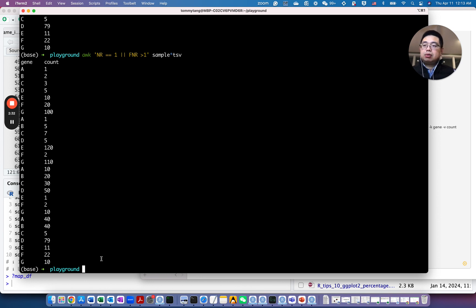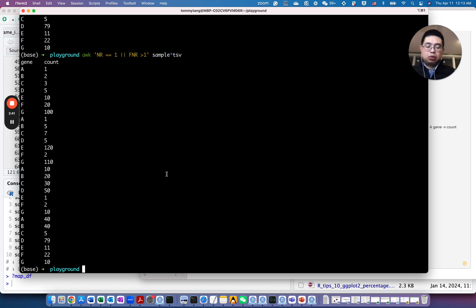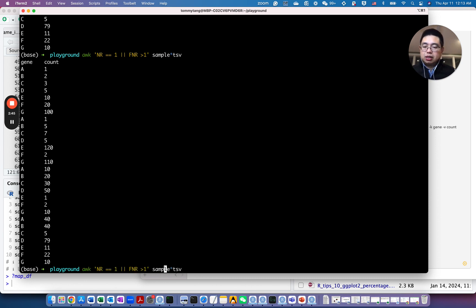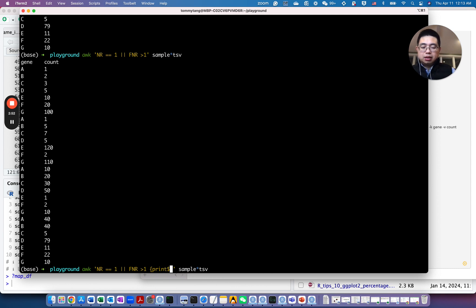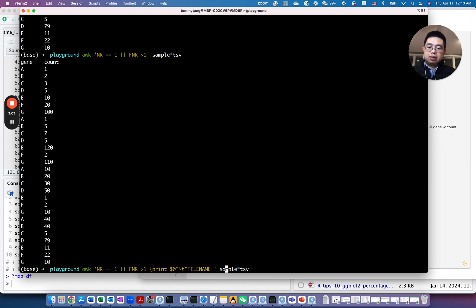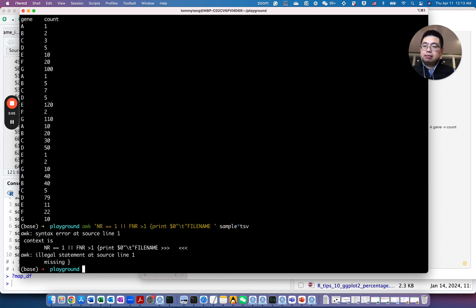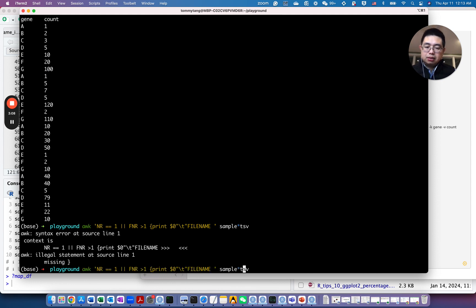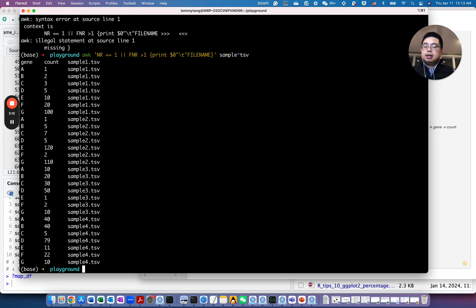But the other problem is, the second problem is, now you don't know which sample this one is from, right? So in awk, there is a built-in variable called filename. So what you can do here, you can use the print function, and you can print the dollar zero, essentially is the whole record for each line, and then use tab, and then filename. So if we do this, see how it looks like.